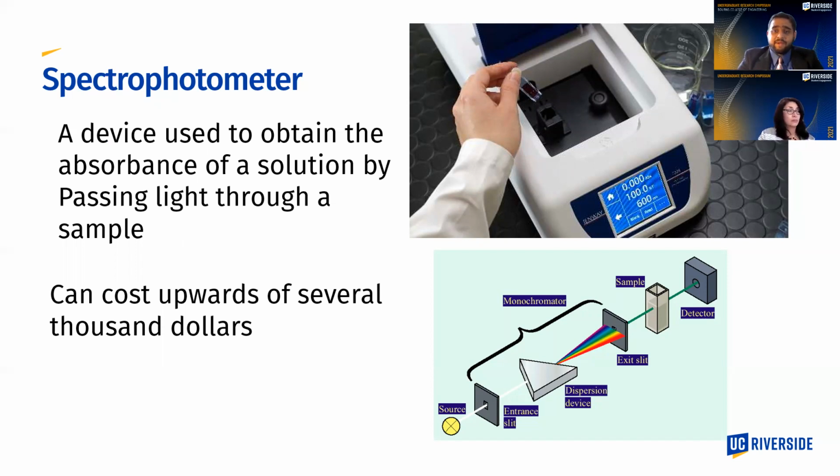Now, the reason I also made a spectrophotometer is because spectrophotometers cost upwards of several $1,000s. So by having this tool as well, I not only save money, but also gain the functionality of an incredibly important piece of laboratory equipment.